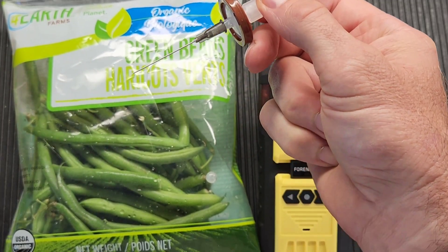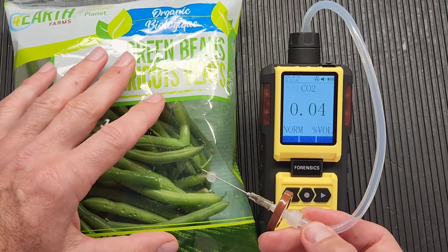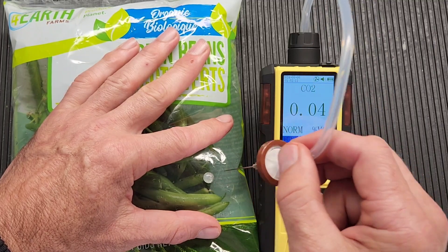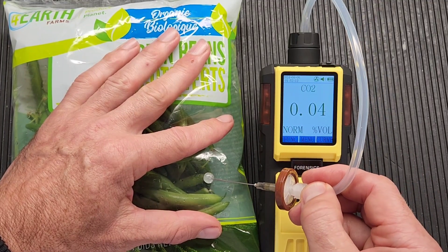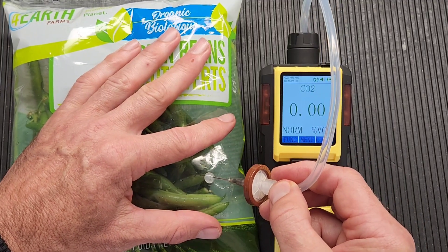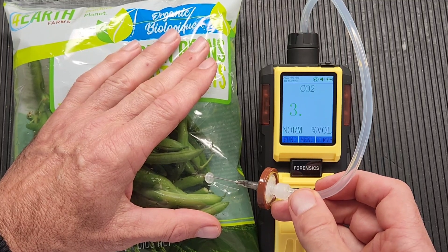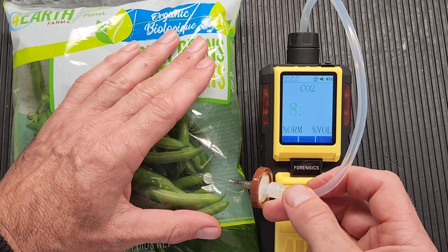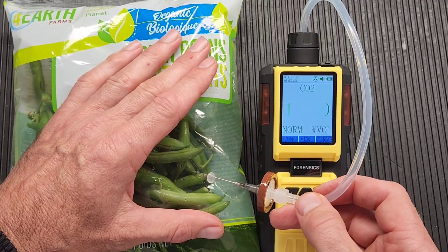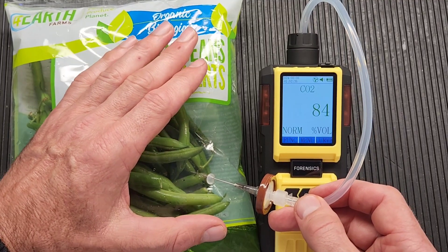When it's time to take a sample, I'll come from this side so we can see the display. We come in on an angle — very important to come in on an angle. You don't go straight down. Once the needle goes through the rubber septa, you will hear the unit strain a little bit, and then soon after you'll see the numbers going up. Usually vegetables and dairy products are flushed with carbon dioxide or a mix of carbon dioxide and nitrogen.